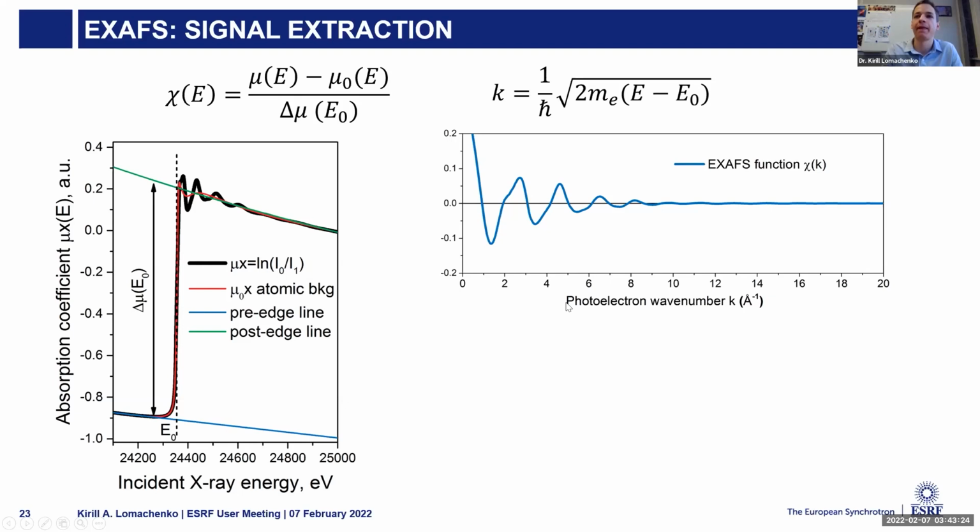scale. But here we did all this for this very beautiful spectrum of palladium K edge, and you see our data, that's already EXAFS data, the EXAFS function chi of k it is called. And the data are very clean, but there is some problem that above like k equal 10, you don't see much, right? So you don't see the oscillations, they are not very intense.